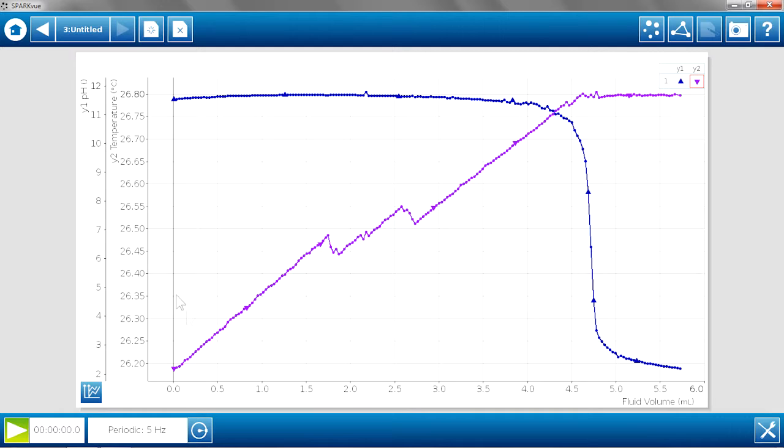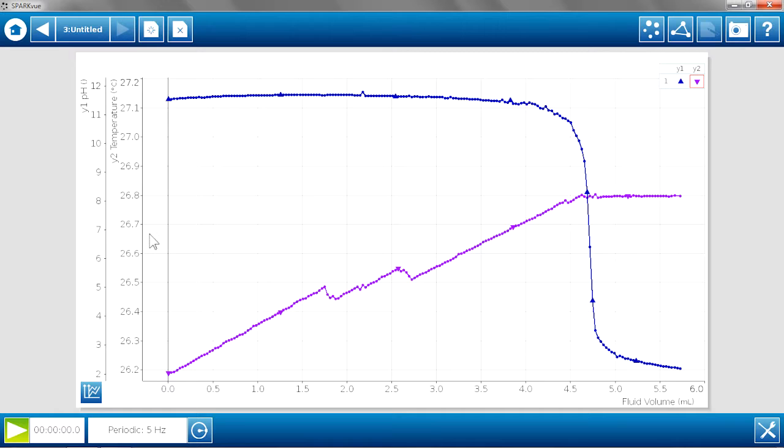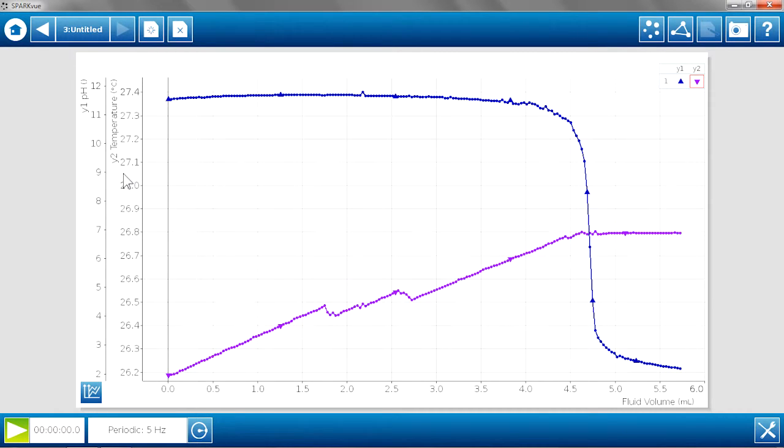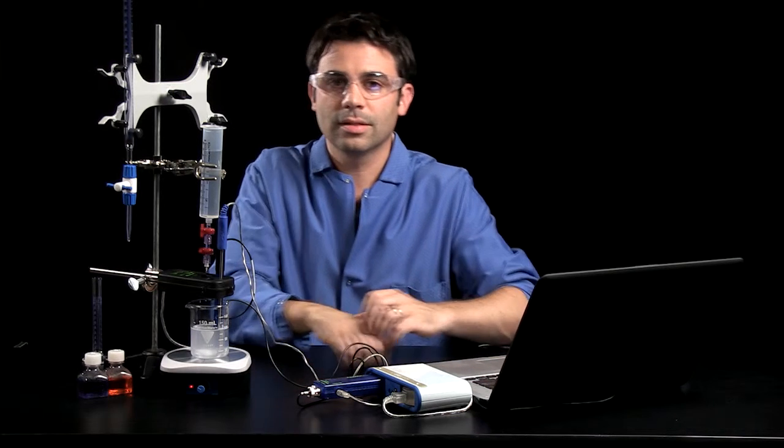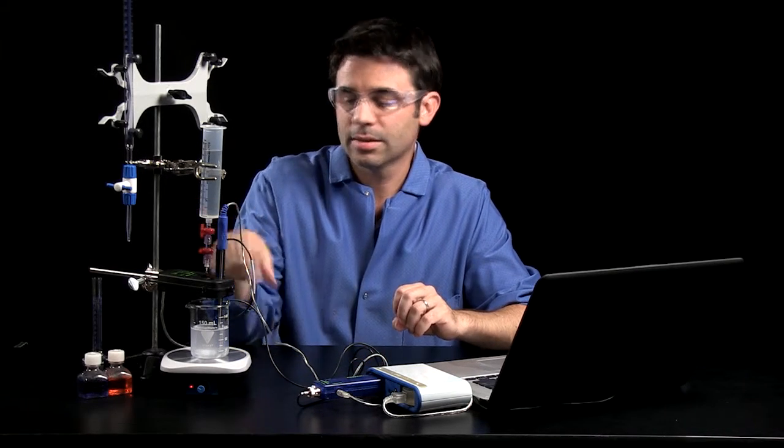And here we have the temperature steadily increasing as the reaction happened. And then once the reaction stopped happening because the equivalence point was reached, then the temperature leveled off, and it would eventually start to cool back down to room temperature. And we can see that that point where the temperature started leveling off is approximately the same point as the pH equivalence point. So we can really get an idea of understanding the system that's happening in the beaker with the reactants and the products.